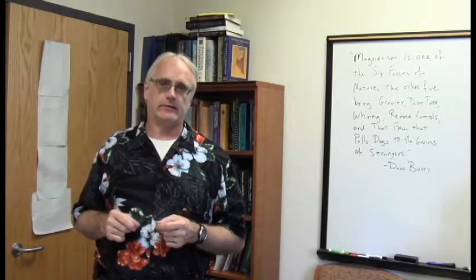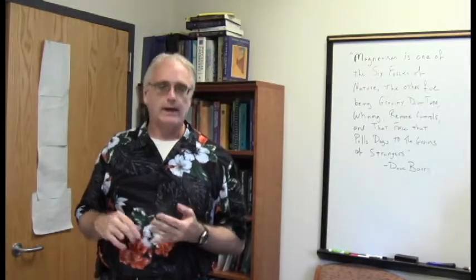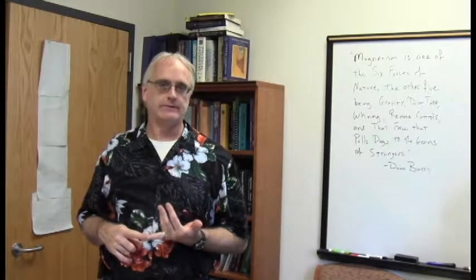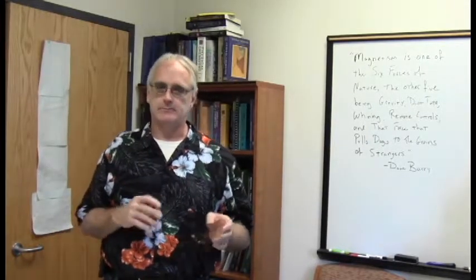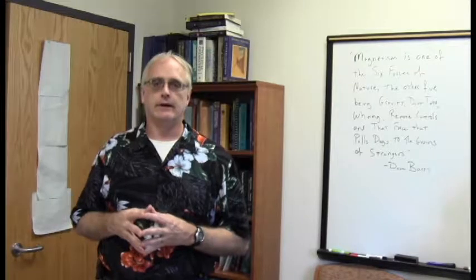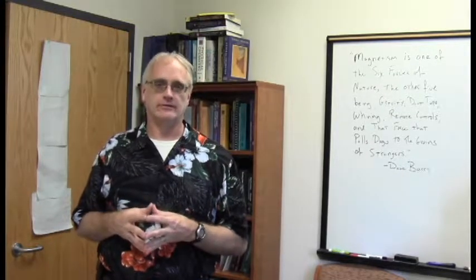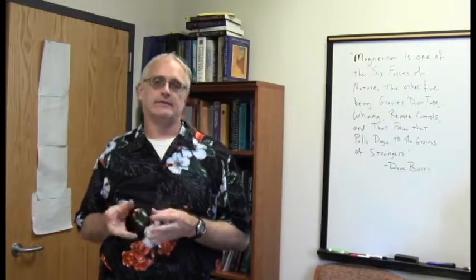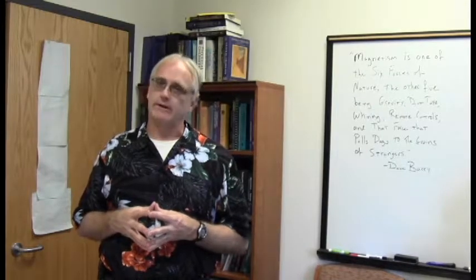Now that we have a pretty good basis for understanding where much of the power of NMR spectroscopy comes from, its extraordinarily high resolution, and the perils of NMR come from the very weak signals that we are actually measuring here. And now we're talking about ways we do our experiments to try to maximize the benefits and minimize the problems. We've already talked about locking and shimming, a way to guarantee that our magnetic fields are homogeneous, and therefore the spectra resolution is as high as possible. Now we're going to talk a little bit about how we actually obtain the spectra and some of the fancy mathematical tricks we use to try to minimize the problems we get from such weak signals.